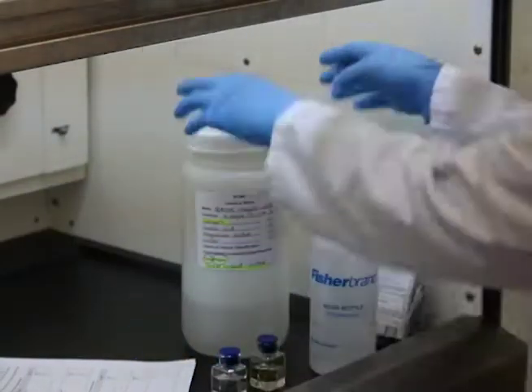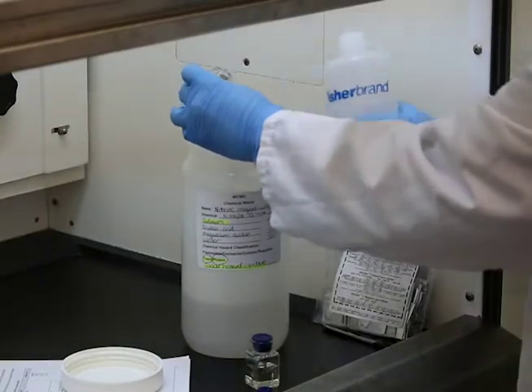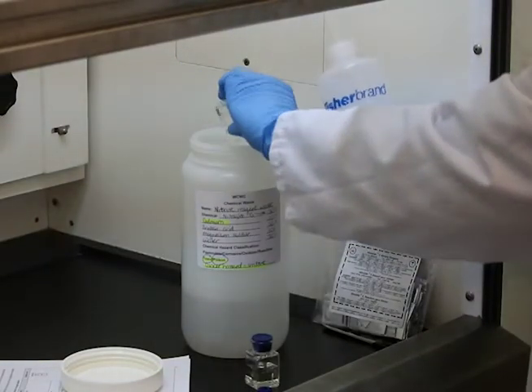The prepared samples contain cadmium and precautions must be taken to avoid exposure. Collect the reacted samples for safe disposal.